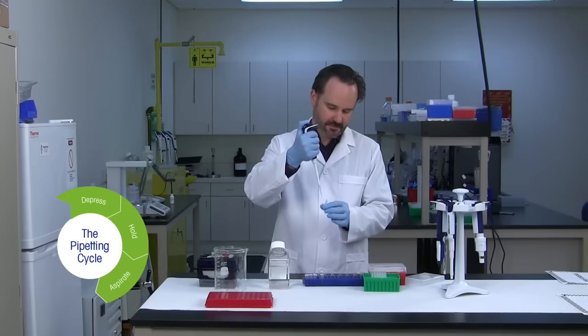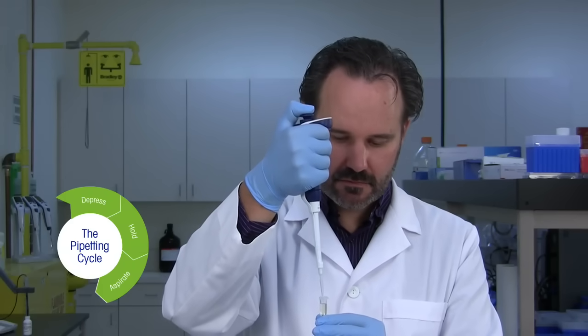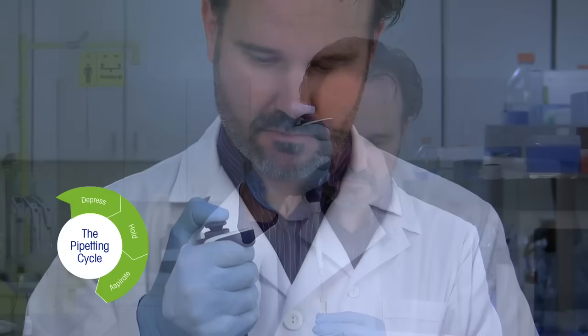Step 2. Immerse the pipet tip in the sample, then aspirate liquid into the tip by slowly releasing the plunger, allowing the plunger to return to its home position.